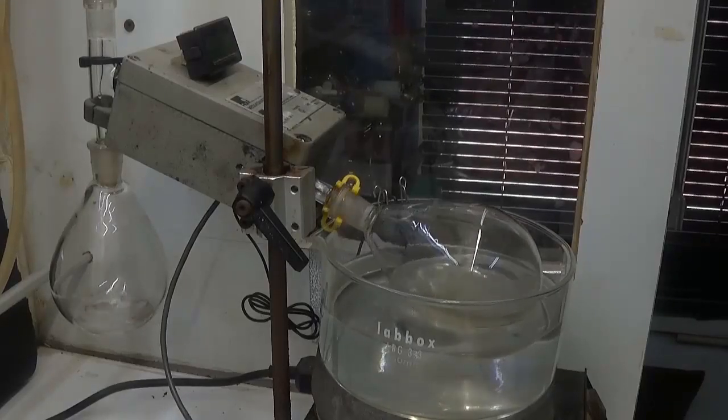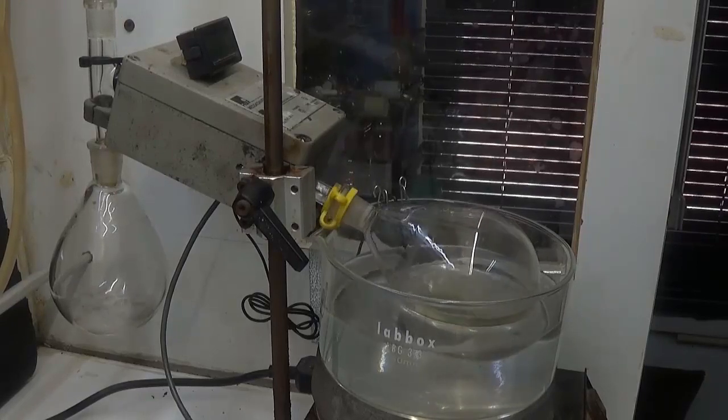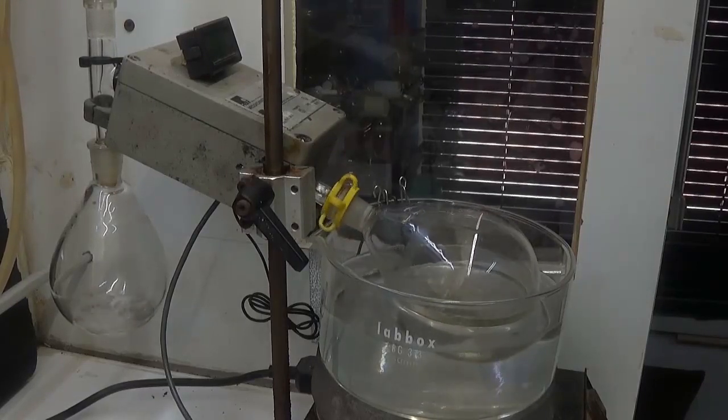Evaporate the cyclohexane in a rotary evaporator with vacuum and leave the product in an 80 degree oven to remove traces of solvent.